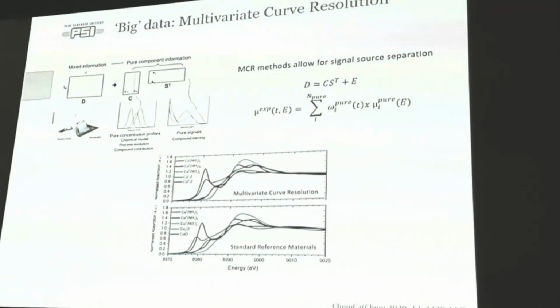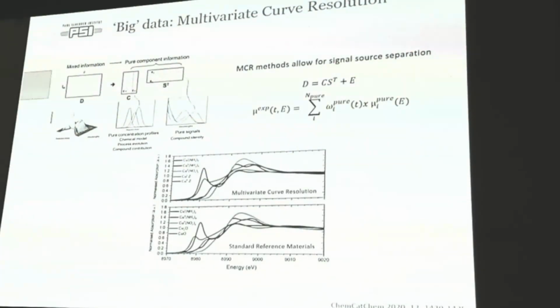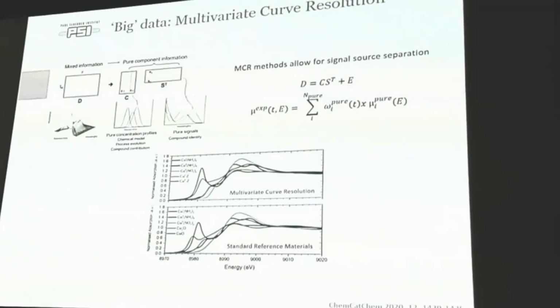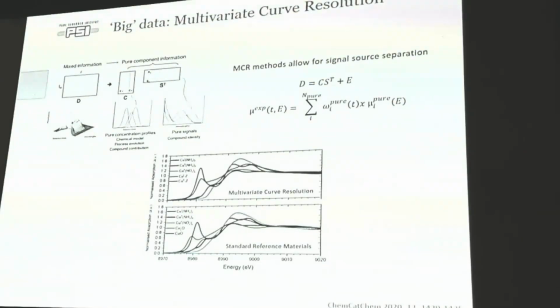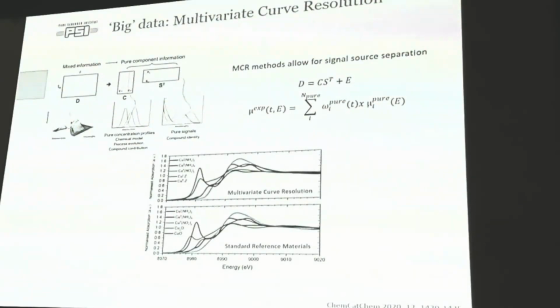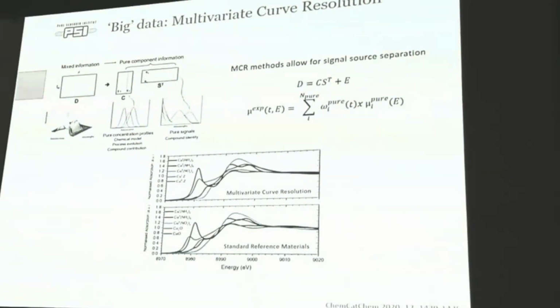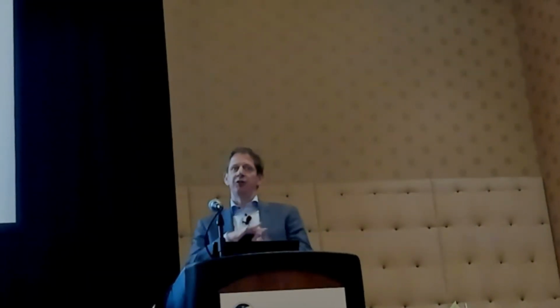Another way to treat this data set is to actually not use reference. So here we use this chemometric method, multivariate curve resolution methods, which basically give you the so-called pure components, right? So the components, the pure spectral components, the species that evolve during your reaction, where your fraction either increases or decreases during the experiment. So it is very powerful to pick out the species, your top species that change. If under all your conditions your copper never changes, we would not have.